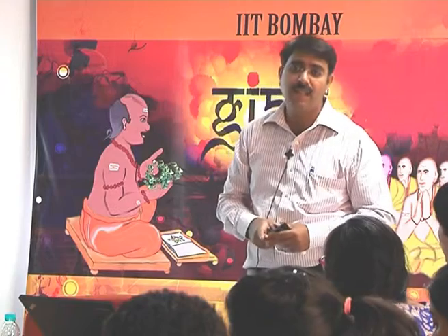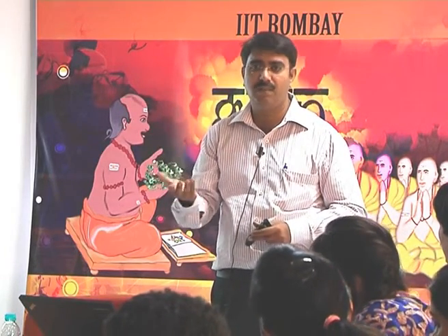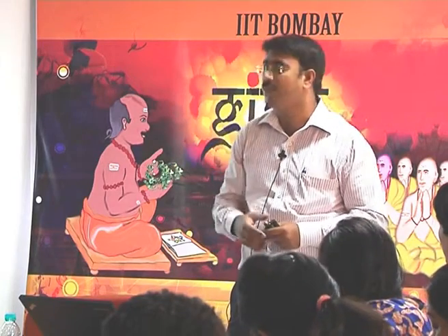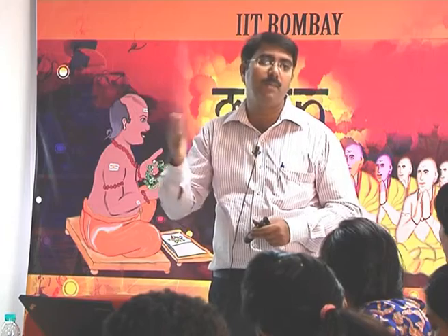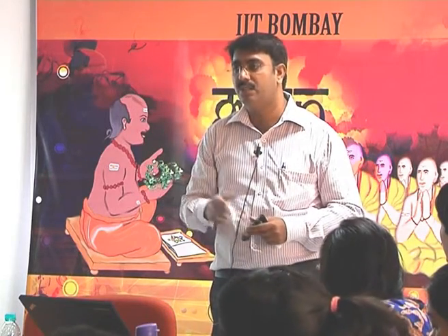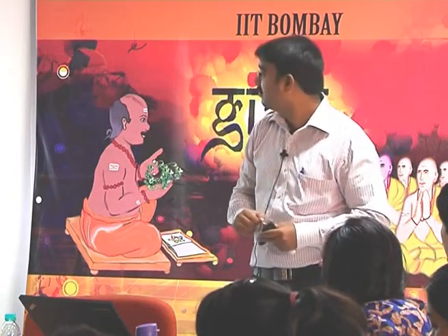Versatility: as I said, you can take samples that are crude, purified or unpurified, any kind of samples, and you can work from pH 1.5 to pH 9 depending upon your applications. Most of these biomolecular interactions we work with at physiological pH.